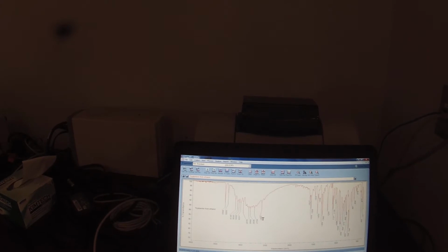These peaks around 3344 and 3283, those are the amine NH stretches, and the fact that there are two of them is evidence that it's a primary amine, which is good because tryptamine is a primary amine, so that's kind of nice. And then these peaks here around 2900, 2800, those are the sp3 CH stretches. Right. And it's expanded over a little bit more of a region than you would normally expect it to be. This peak I don't care about, so I'm just going to delete that one. And that's probably because it's the fused aromatic rings.